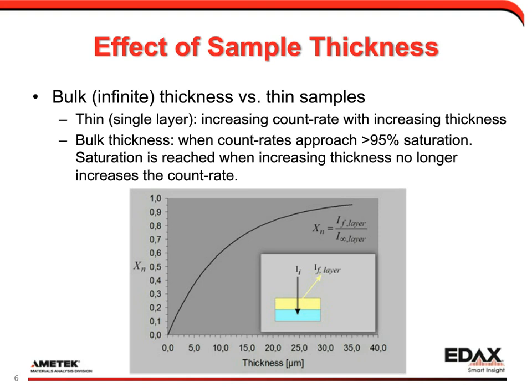The values sometimes vary depending on the source. I've seen 90% absorption, 95 or 99%. But the main takeaway is that the X-ray response at that point is nonlinear as it starts to approach saturation.